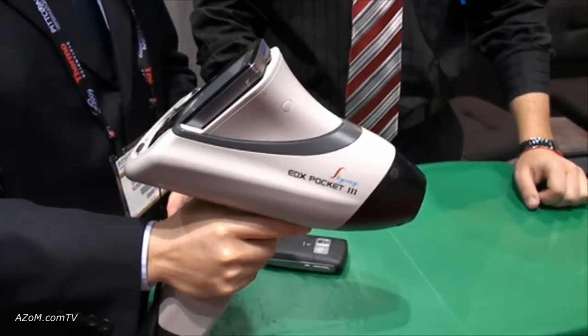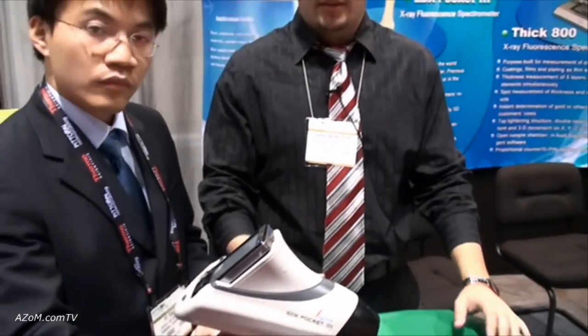This instrument has a very lightweight design and its ergonomic design gives you a comfortable yet effective way of testing samples, whether it be in the minefield or whether it be a small piece of jewelry or clothes.